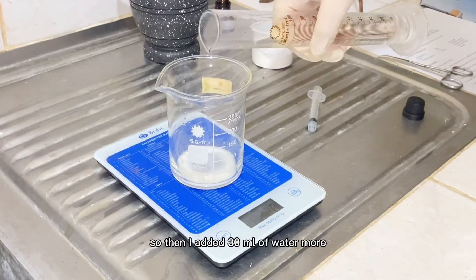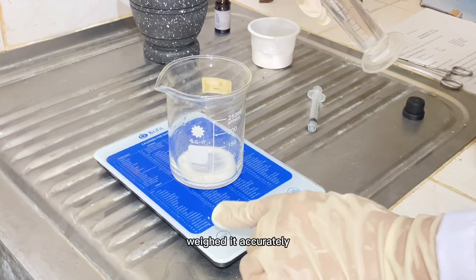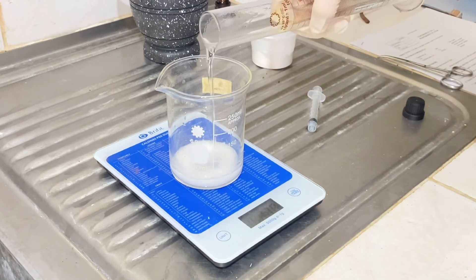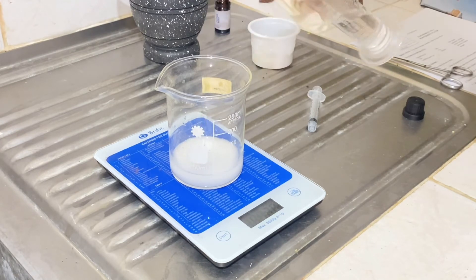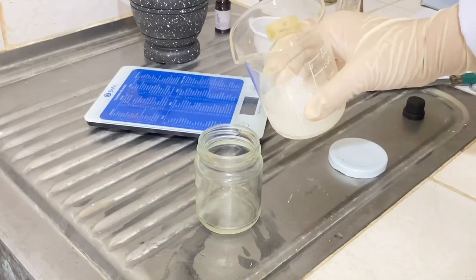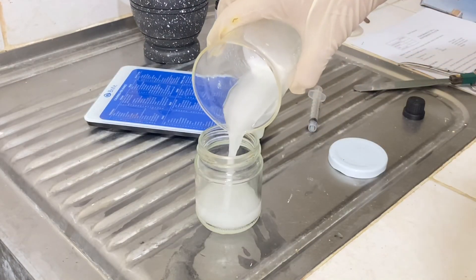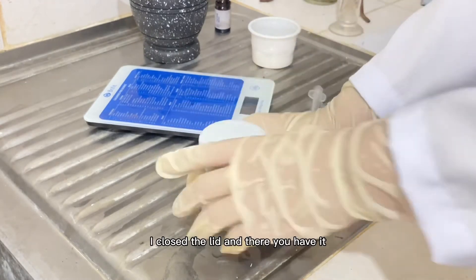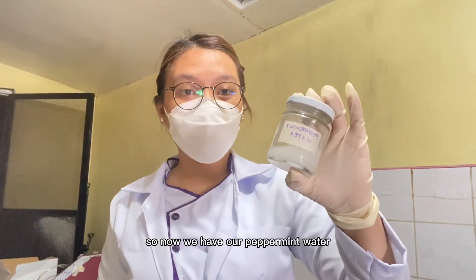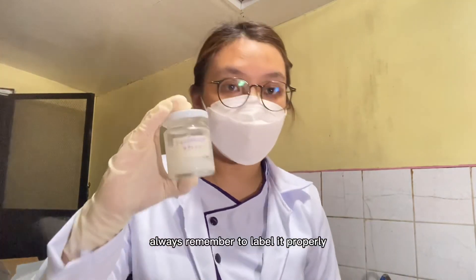Then I added 30 ml more water — I measured it accurately — and did a little bit of mixing. Finally, I poured it into the glass, closed the lid, and there you have it — our peppermint water. Always remember to label it properly.